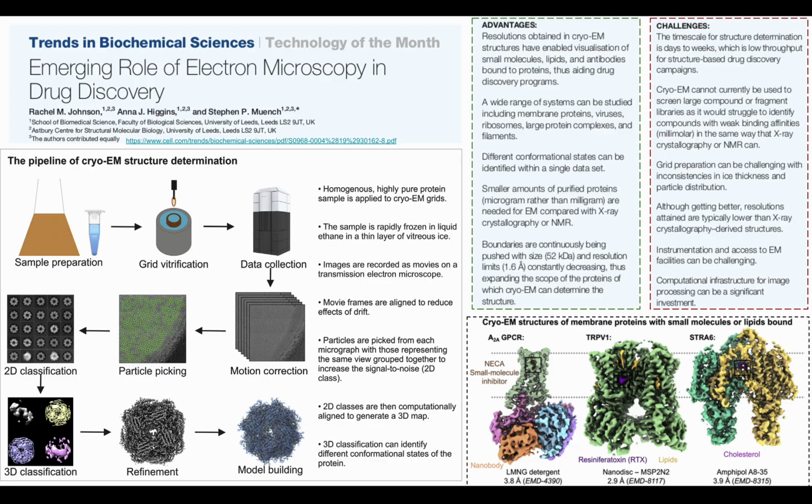For example, in the later slides we'll see an example, but if my protein is involved in some kind of biochemical pathway which increases when it binds to some other ligand, then it increases the signaling and leads to cancer. So in such scenarios what I can do is design a drug which can compete with that ligand and bind to my protein. In such a scenario it can inhibit the process which was taking place previously. So with the help of electron microscopy I can see whether my drug will be interacting with the protein. If yes, then whether it is destabilizing my protein.